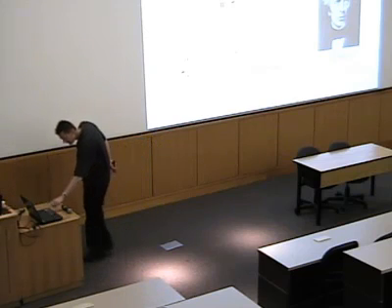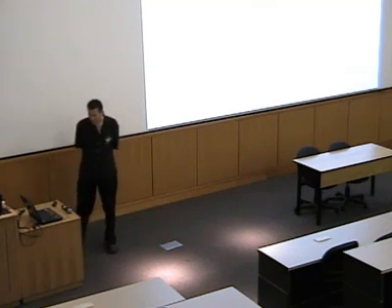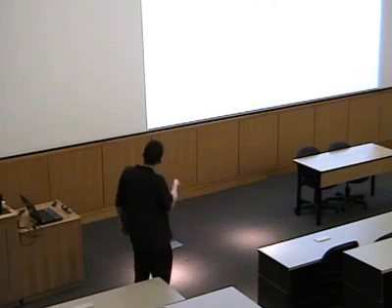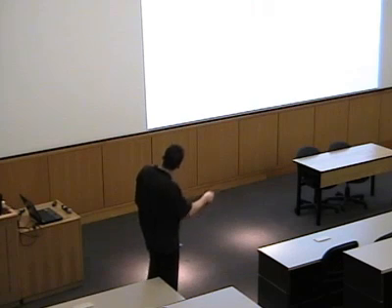Now, in order to understand this, we need to learn a bit more about linear polarized light. Linear polarized light is actually a superposition of two beams of circular polarized light. One is left circular polarized, the other is right circular polarized. If you superimpose them, you end up with linear polarized light. Here's a picture of a circular polarized light wave. This is left circular polarized light. If you're standing on this side and the wave is approaching you, you can see the electric field vector rotating while the light is propagating, so you get this helical motion. Watching the beam approach you, you can see that the electric field vector rotates counterclockwise, and that makes it left circular polarized light.